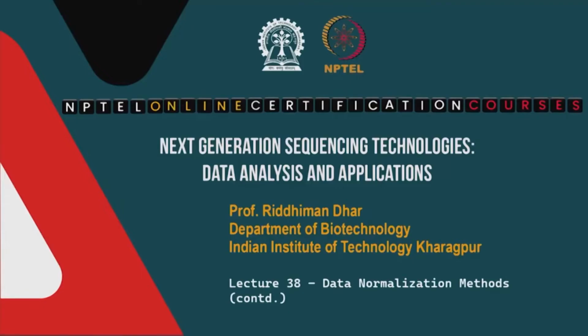In the last class we started talking about data normalization methods. We talked about some of the methods that address this gene length bias as well as the sequencing depth variation, and then we talked about between sample normalization. So, we will continue on that in this class and we will discuss more sophisticated normalization methods.